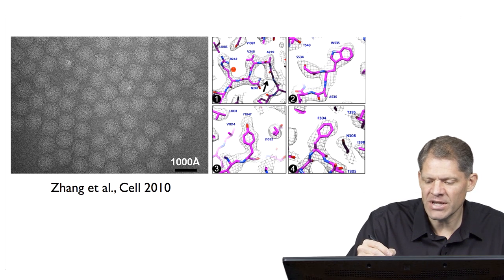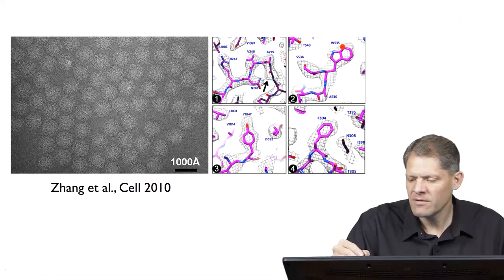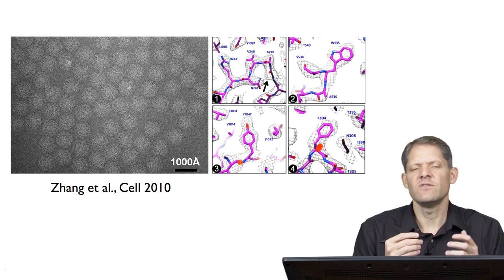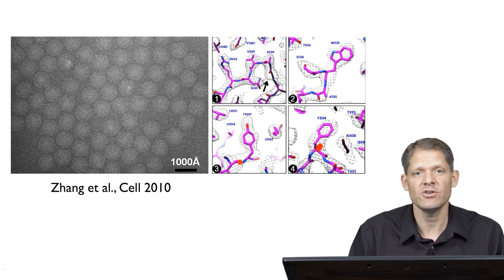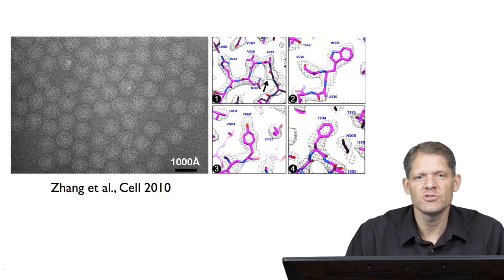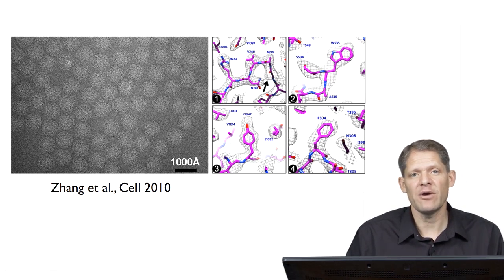For instance, this arginine and even a valine is visible. Here, a tryptophan makes a very nice big side chain density that can be recognized. A phenylalanine here, and a tyrosine. And so when you can see these bulky side chains on the map, it anchors the sequence into the right location. And once an initial model is built, it can be further refined through, for instance, simulated annealing to better match the stereochemical constraints. So that's how you generate a model de novo from a cryo-EM reconstruction.